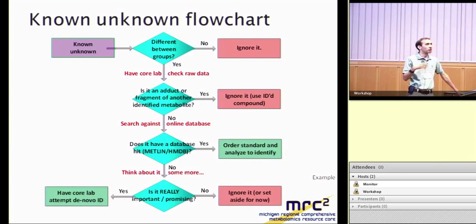If you have a larger list of hits, you have to use some more chemical intelligence to say, what are metabolites that I expect to find in my species? What is this list of 10 hits? What does it have on it? That would be a common or abundant metabolite. Abundant metabolites are more likely to match what you see in a data set more commonly. But you use your intuition, and you order the most likely candidate.